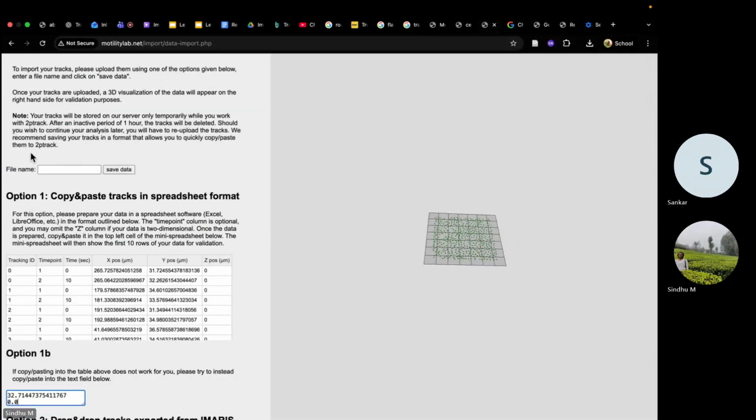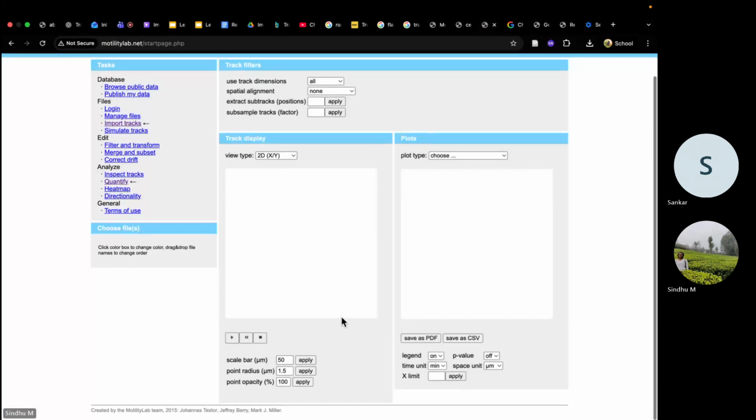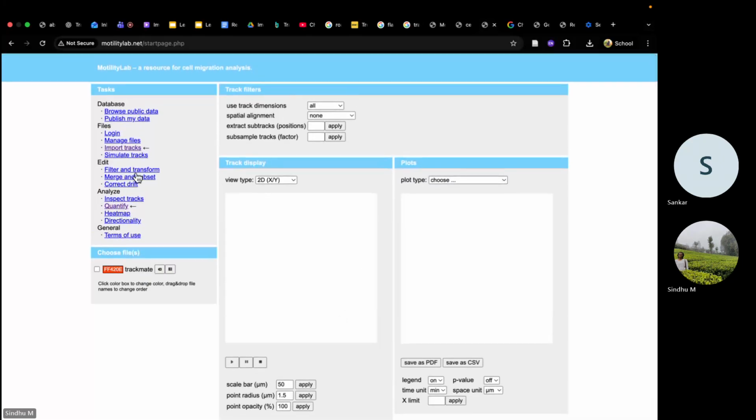So now I'm just saving it here. So now that the data is saved, I'm choosing this for the analysis.